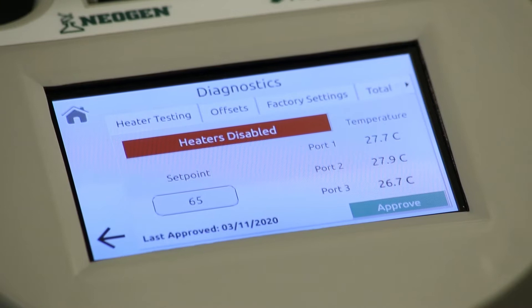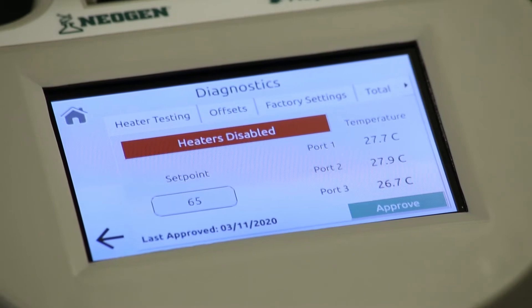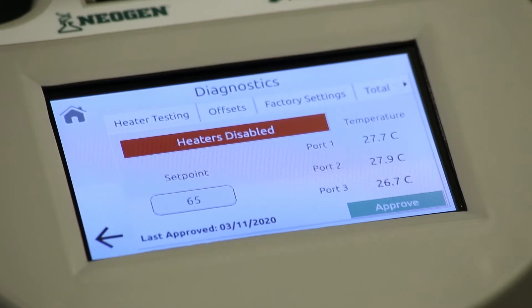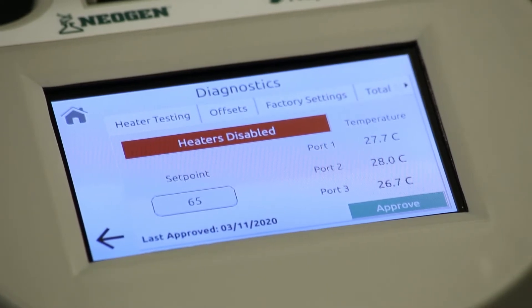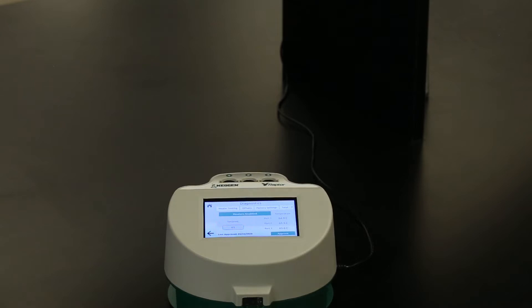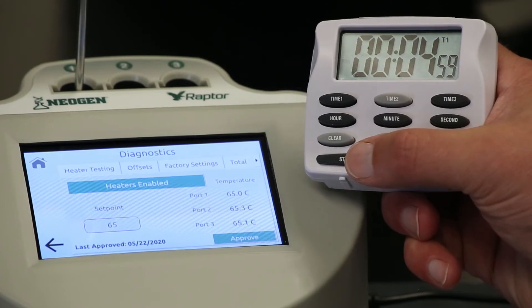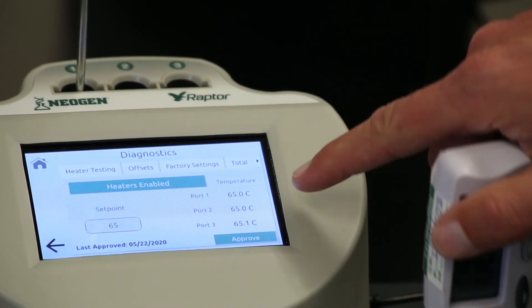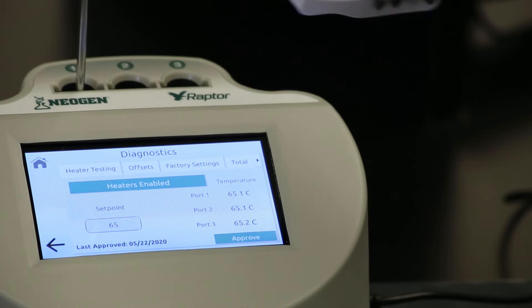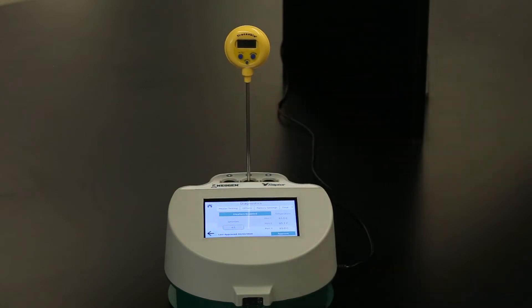Diagnostics is used for annual heater verification. The FDA Laboratory Proficiency and Evaluation Team is comfortable with annual heater verification instead of daily verification, provided the real-time temperature readout displays on screen as well as on a physical printout. To perform this verification, enable the heaters by pressing the Heaters Disabled button. Once the temperature has been reached, insert the NIST traceable temperature probe into the first port and set a timer for 5 minutes. At the end of 5 minutes, compare the reading on the screen to the reading on the temperature probe. If the reading on the temperature probe is within 1 degree Celsius of the display temperature, the verification is considered valid. Move to port 2, then 3, and repeat the process.